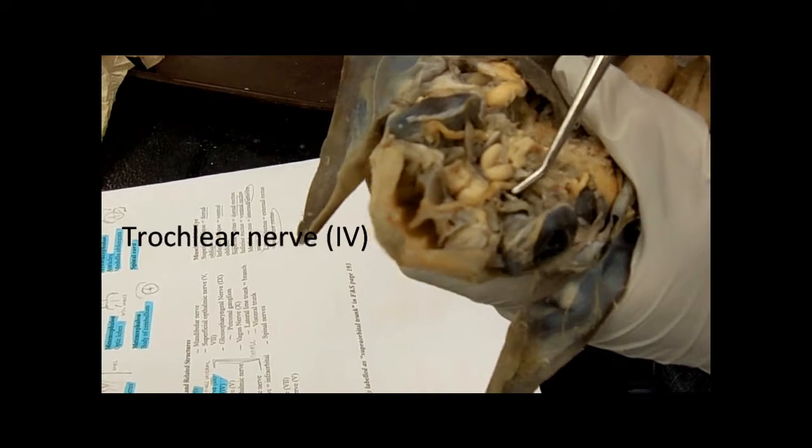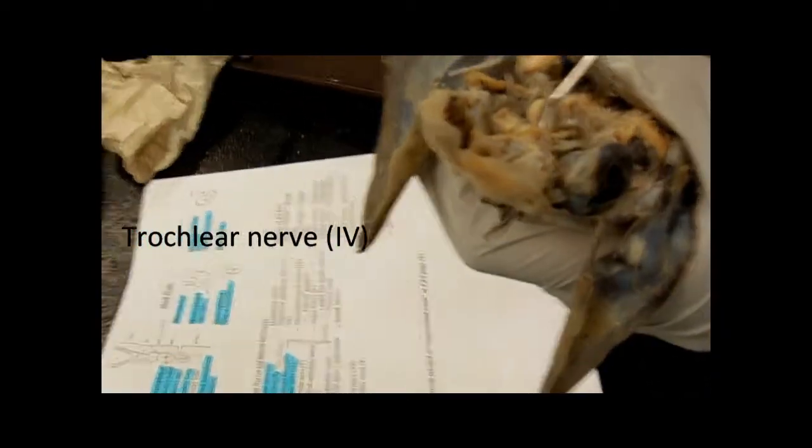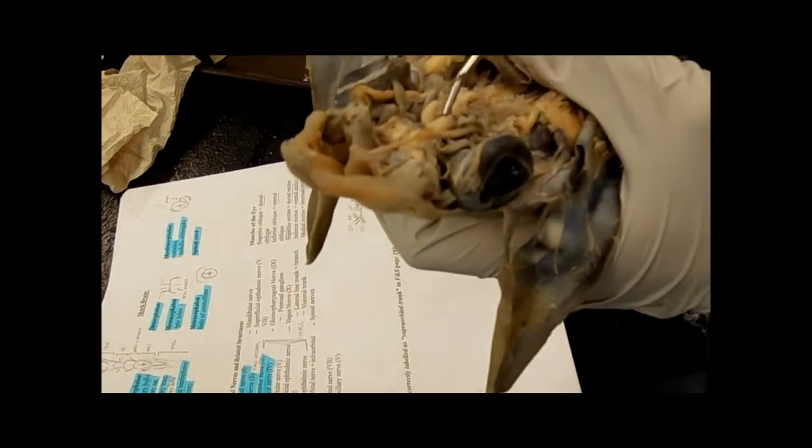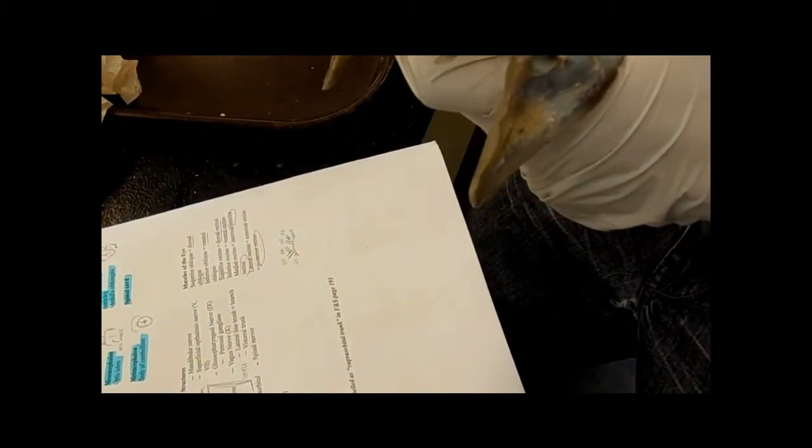So those are the muscles. Like this one's important, this is the trochlear nerve that I already kind of fucked up. It branches right off to the superficial ophthalmic.